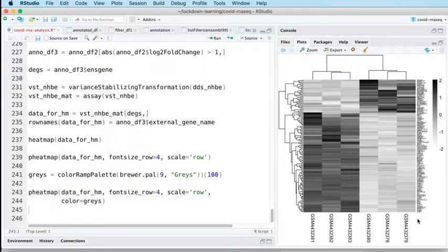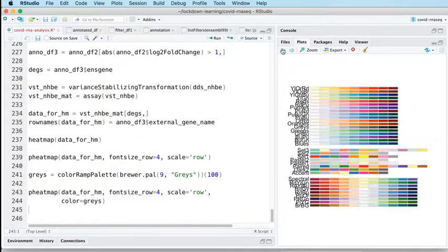But the Color Brewer palettes allow us to quite easily configure these heat maps with different color schemes. So if you wanted to use Peter's color scheme of choice, which makes no sense in this, but I'm going to do it anyway. I'm going to pander to Peter for some reason.